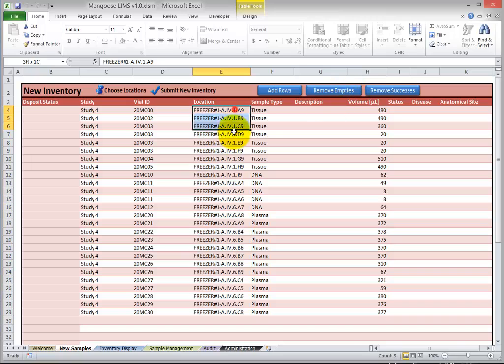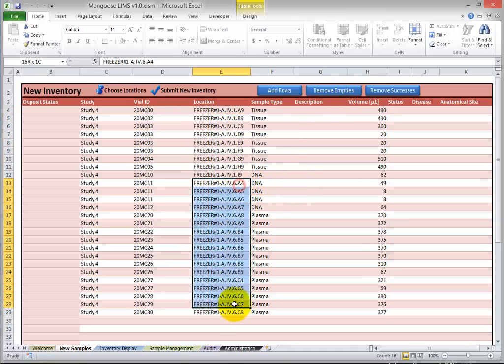So note that I put some vials in this box, Freezer1A41, and I put the rest in this box, Freezer1A46. So before we submit, notice that we have some duplicate vial IDs here.